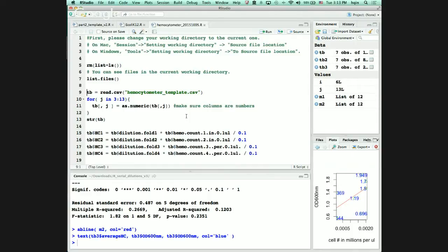Okay, I'm going to give people like Green a few minutes to recover. No, you shouldn't open it with Excel. The file should be read into RStudio. Yeah, but that's what I'm trying to do, getting this to work now.